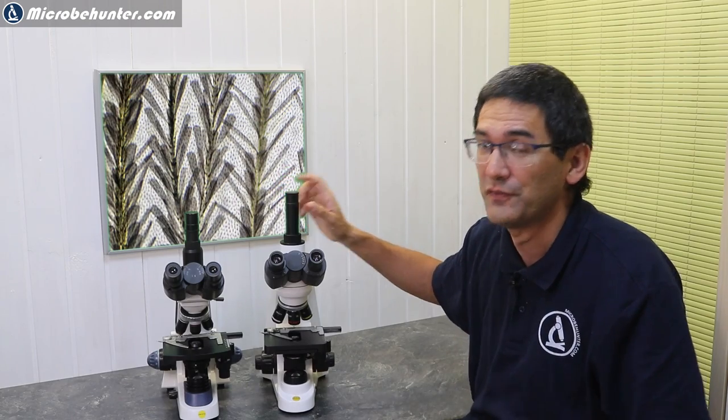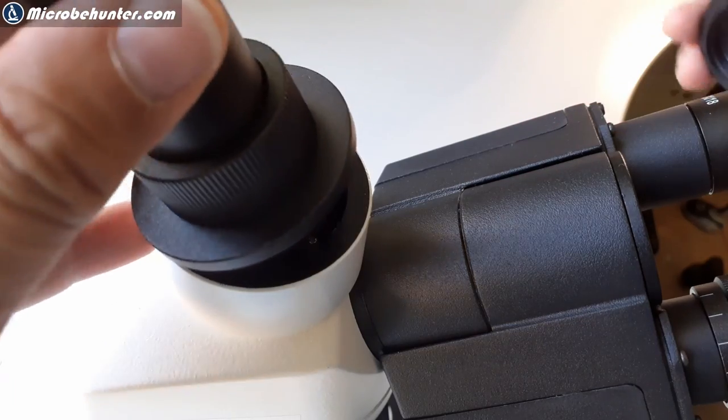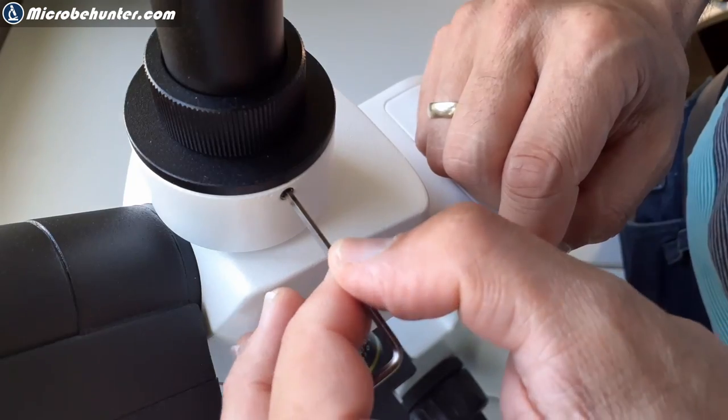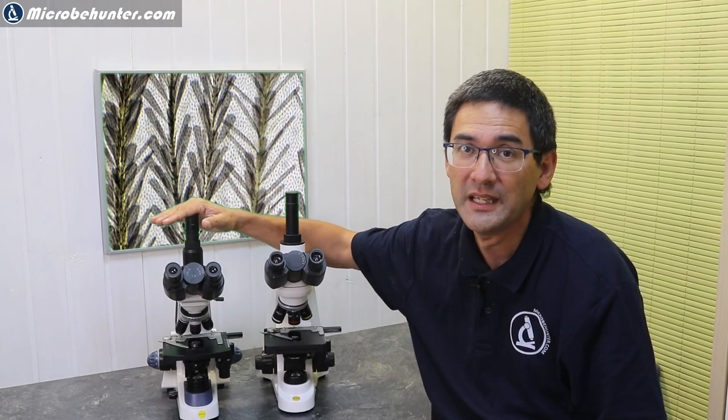This basically means that for storage purposes inside a cupboard you might take this into consideration, but it's also very easy to remove this top part of the photo tube, which makes it smaller. The same can be done with the other microscope, the 380T.